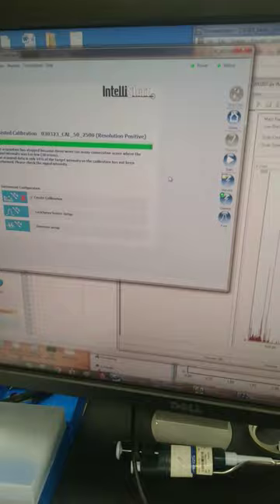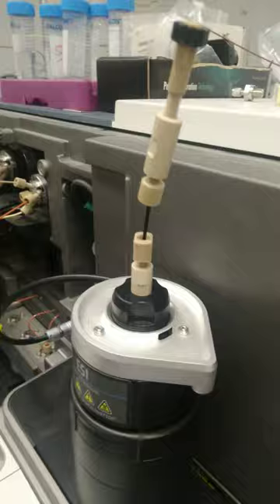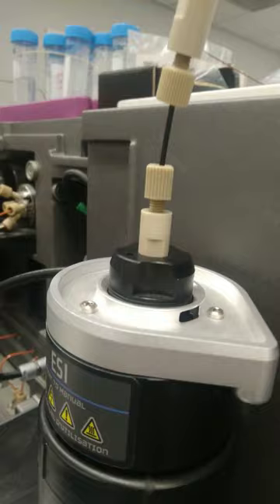I've made a file which I want to calibrate. I'm going to use assisted calibration on the Synapt Intellistart. I've hooked up basically a needle seat to a union to a small piece of black capillary tubing, and that's all fed into a 250 needle seat slow.